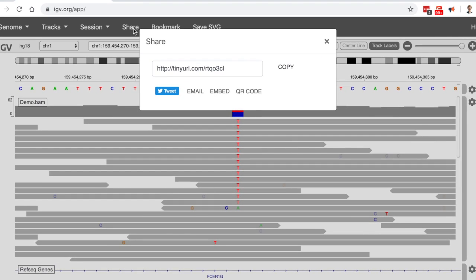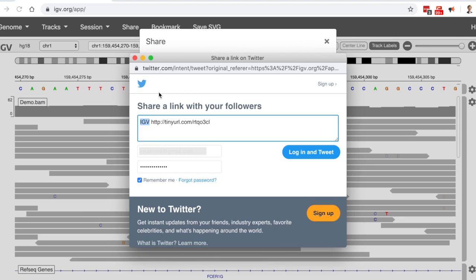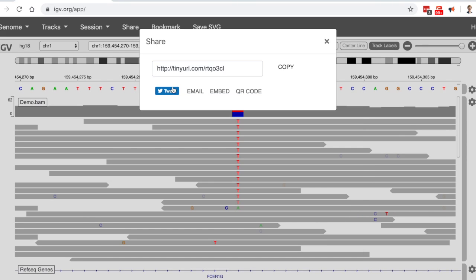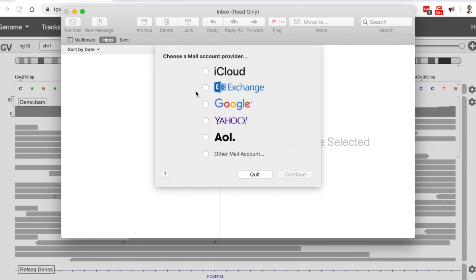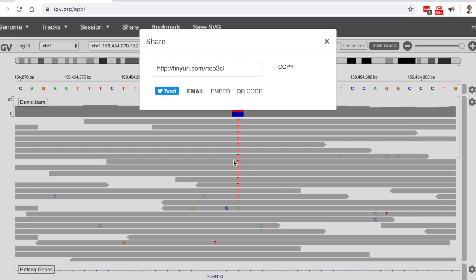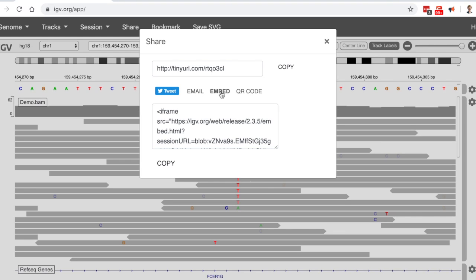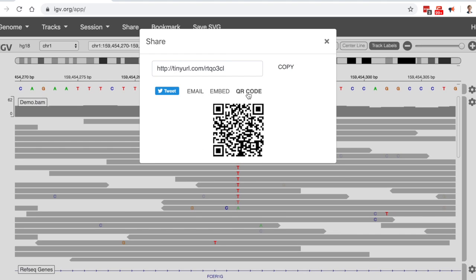Here there are a few options. First, I have the option of simply copying the data view URL to share it with others in whatever way I want. I can also use the Tweet and Email buttons, which provide shortcuts for sending the URL to others directly. The Embed option generates an HTML snippet that I can use to embed the view in a web page. And finally, the QR code creates a 2D barcode for the URL that can be included on a poster, for example.